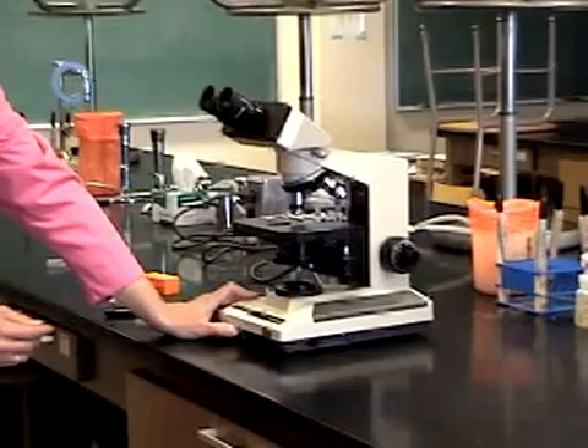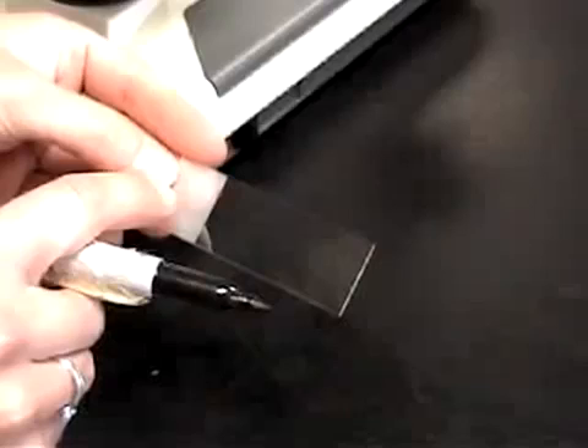Remember to clean both the ocular lenses and the objective lenses. Be sure to use lens paper and clean the 100x oil immersion lens last, in case there's any oil left on that lens.